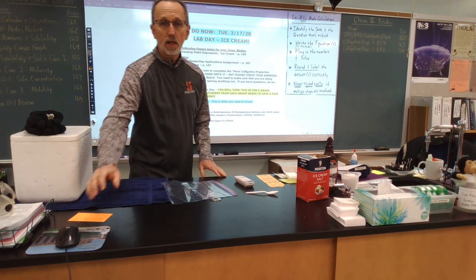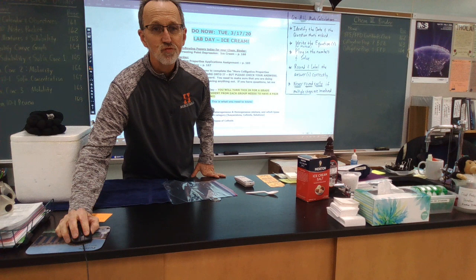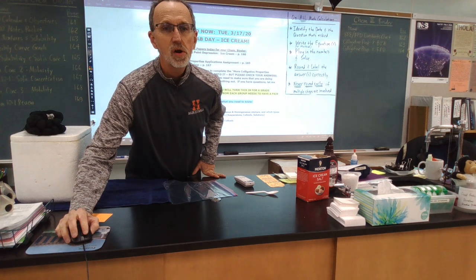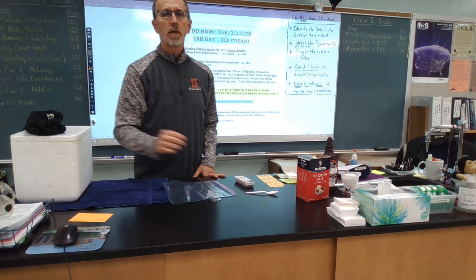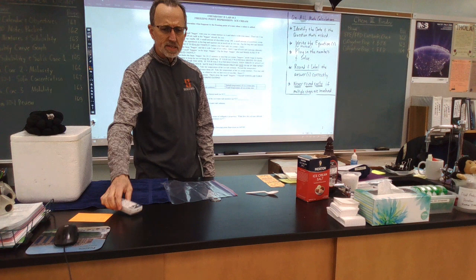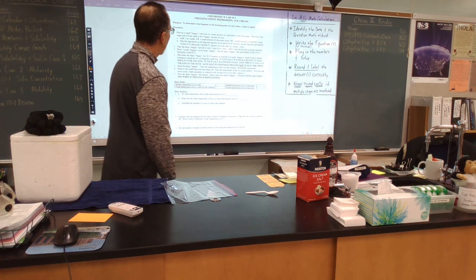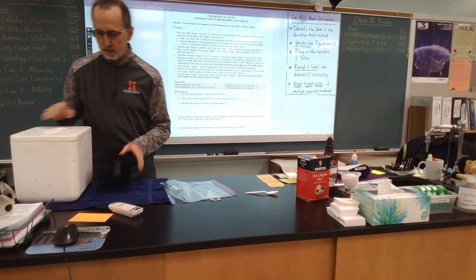So let me pull up the assignment here behind me. There we go. Okay, and we'll unfreeze that. So this is the lab sheet for Lab 10-2. So basically, I'll show you what we got here.